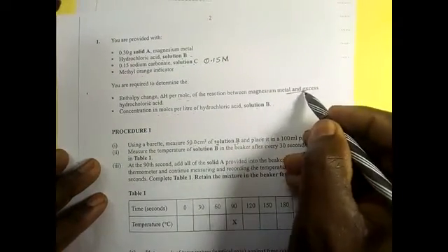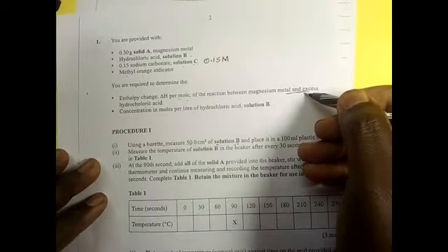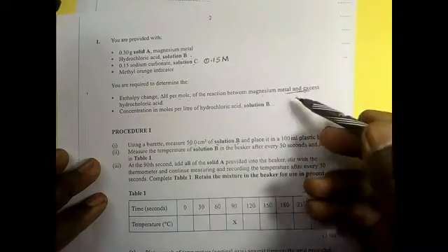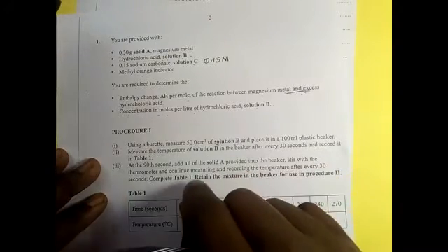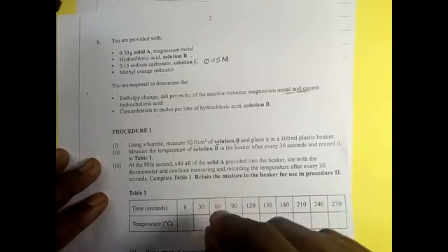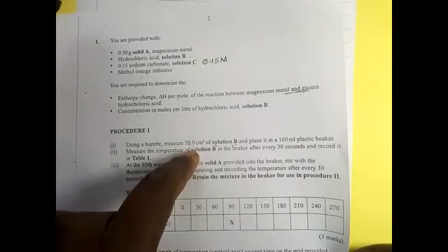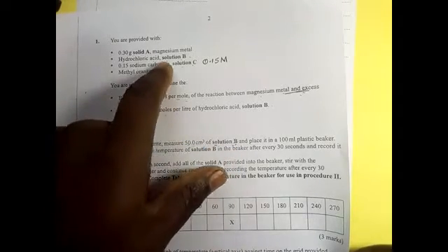It was in excess, so a certain number of moles reacted with the magnesium, and some acid remained. Now we are taking the HCl from the first procedure to dilute it more in procedure 2. So you should have in mind that from procedure 1 we take the 50 cm³ of solution B, which is hydrochloric acid.